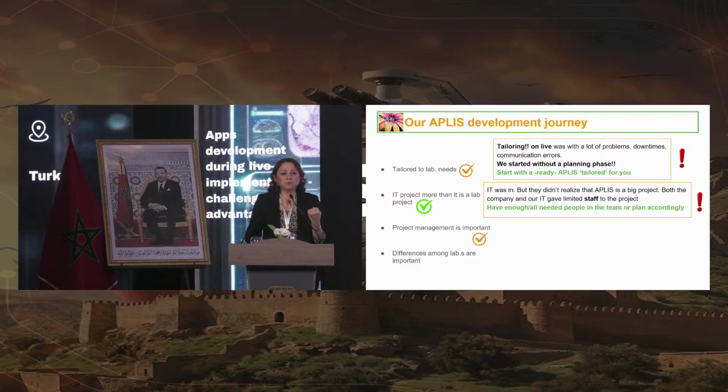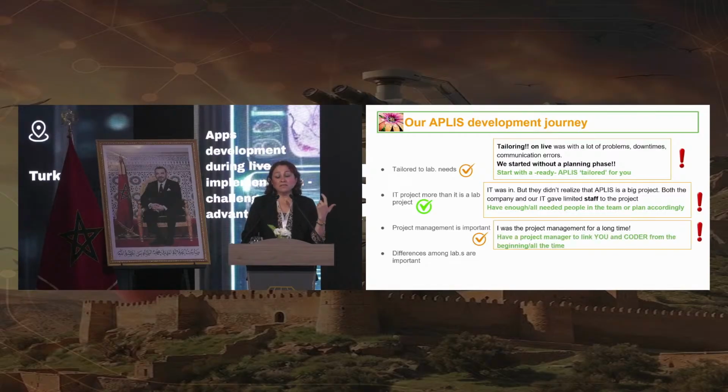Project management is important and a must. As doctors, pathologists, we are not familiar with the term project management. It's an engineering team, in fact. And I was the project manager for a long time for this APLIS development. I'm a good manager. I have a lot of projects, but I am not a project manager for an IT project. So have your project manager from the beginning, and be sure that he or she links you to the vendor, to the coder, and aligns what you say and what they understand.